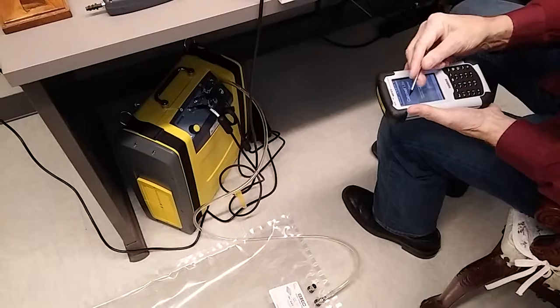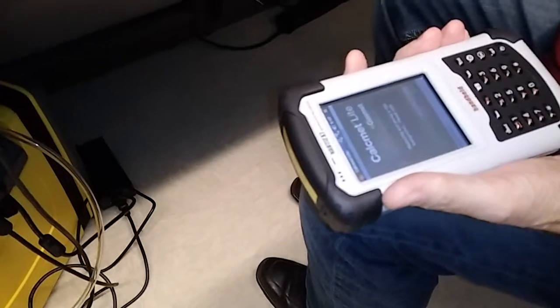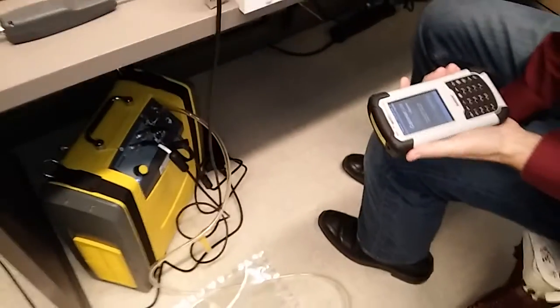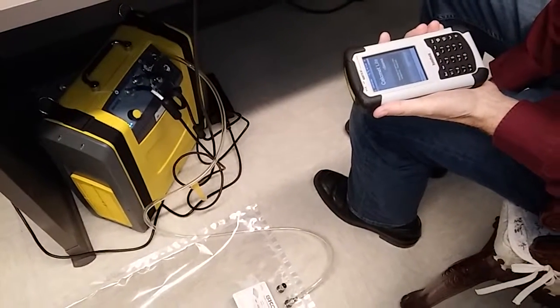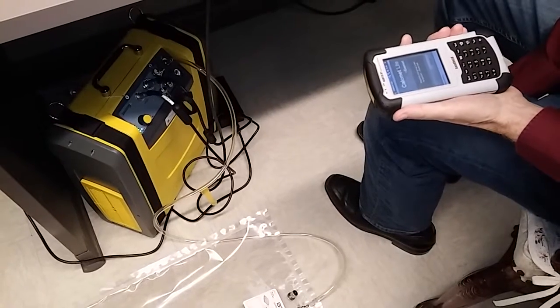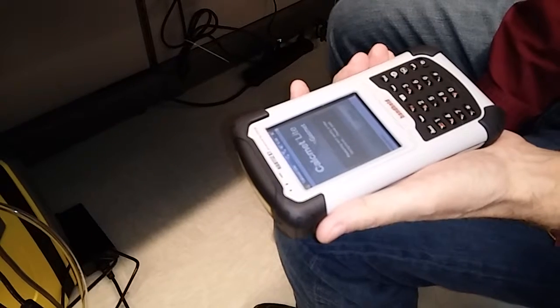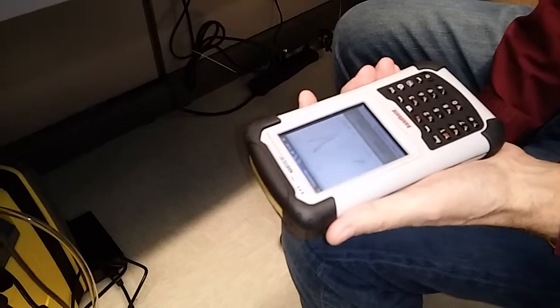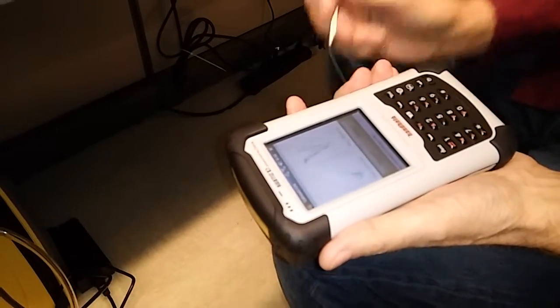So it's going through, it's showing the progress of it. So they should zero it out. Measuring and saving a new background. Yeah. So we're waiting. And that basically shows us what the zero is.